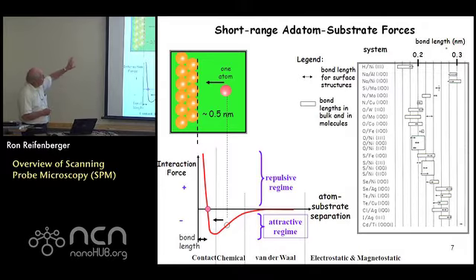So if I just drop that atom onto the substrate and I measured how far it was from these atoms, I would get a number that would be 2 to 3 angstroms, which is of course just the separation between atoms in any metal or in any semiconductor. Atoms in metals and semiconductors tend to be 2 to 3 angstroms apart, one from another. Of course, the reason they're that distance is because there's no net force acting on them. That's their equilibrium position, right?